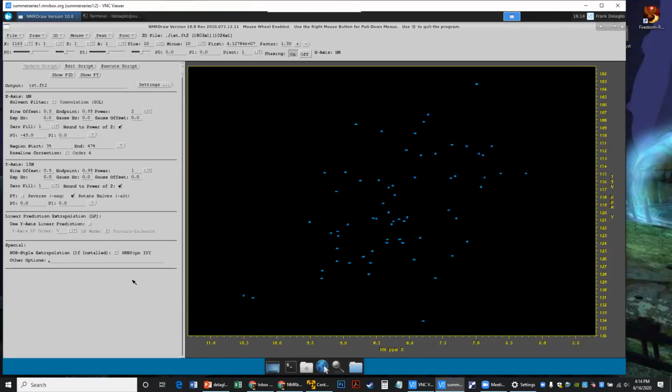Okay. So NMRPipe's IST by default generates the spectrum directly. And so if you were to inverse transform the data, the parts of the time domain that were measured originally do not necessarily correspond exactly to the result that you would get. Is there a way of getting the degree of match calculated or reported? Sure, you can do that.